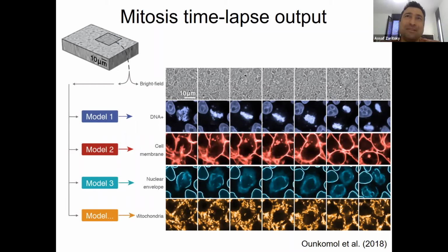And here, when I stress that on the hallucination effects, right? Here hallucination would kill you. Because if you want to understand where organelles are touching each other, but you cannot trust the localization of your organelles, it's not anymore just a general similarity of images. You want to really know that what you get is right, right? And if you get false organelles, then it's a problem because you cannot learn any biology out of it.